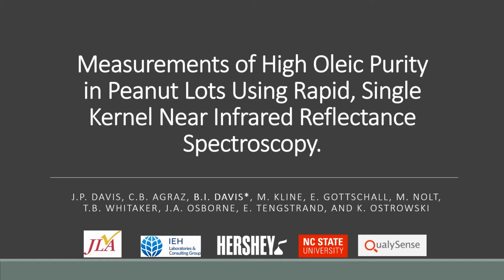Today I will be presenting measurements of high oleic purity in peanut lots using rapid single kernel near-infrared reflectance spectroscopy. This was a joint effort with JLA IEH, Hershey, North Carolina State University, and QualySense. I would like to thank my colleagues for their contributions.